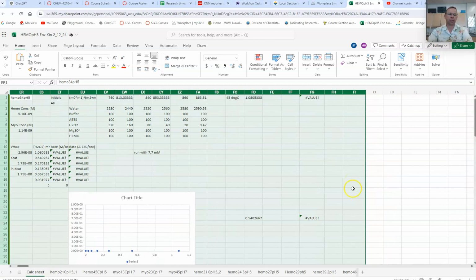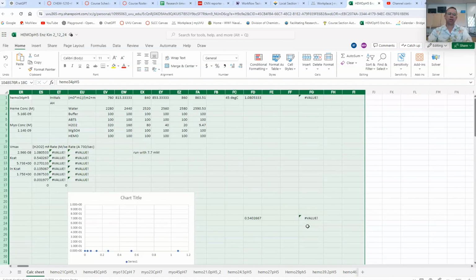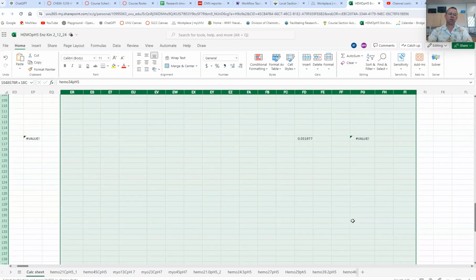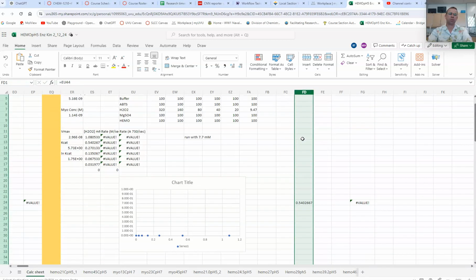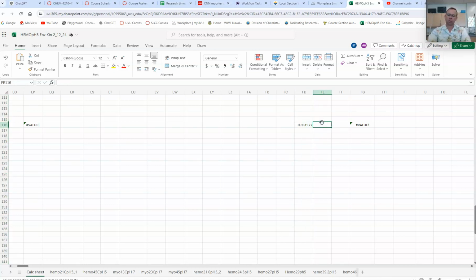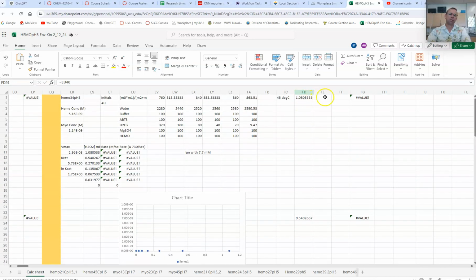The one that's furthest to the left on these data sheets is the first run, and that's the lowest concentration. So I come down here into my calc sheet where I'm going to paste this data that I collected, and I paste it to the lowest concentration. These values in this column are the concentrations of hydrogen peroxide that the runs were run at. Concentrations vary from run 1 to run 6, having increasing concentrations. This is the lowest concentration, second lowest, right? This is the highest, or the 6th run.